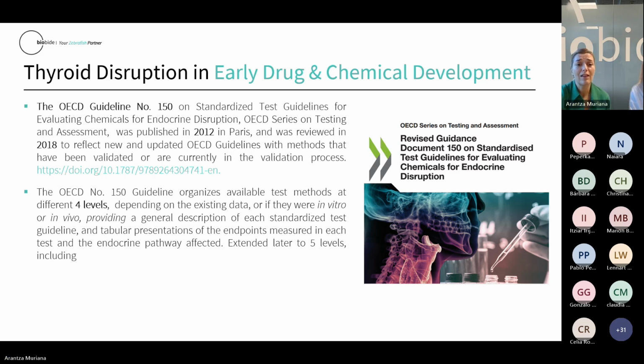So it's really a very new area, endocrine disruption, and it needs a lot of review and a lot of studies and research yet. The OECD number 150 guideline organized available test methods at 4 different levels, depending on the existing data, on whether they are in vitro or in vivo, and providing a general description of each standardized test guideline used for endocrine disruption screenings.